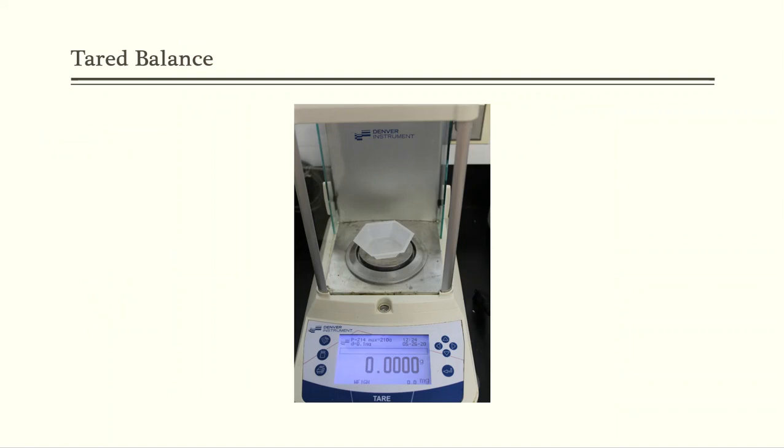That's what this is. The analytical balance cost us around $3,000 a piece. We have about 8 to 10 of these in our laboratory facility, and they're all hooked up to a printer. So when you get a readout down here on the balance, our students can hit the print button right here, and that will print out a receipt ticket with a printed confirmation number as far as the mass goes.